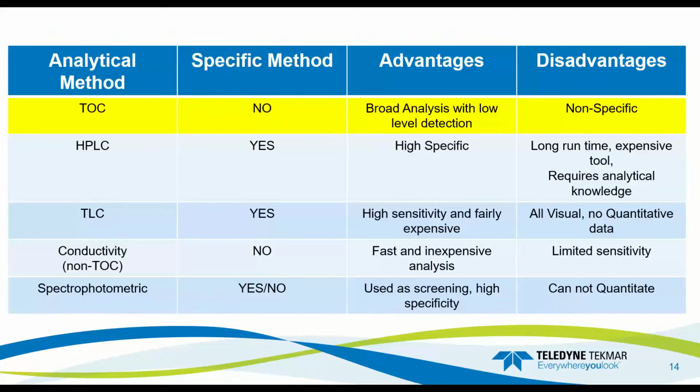Is it compound specific? No. Can it tell me if there's benzoquinone, or can it tell me if it's benzoquinone versus another material in there? No, it cannot. But what it's going to do is it's going to tell me my carbon level. And if we go back to what carbon is, it's living organisms, decaying matter, synthetics, organic products, or other material that have carbon in, because carbon is a basic building block of everything that we know.